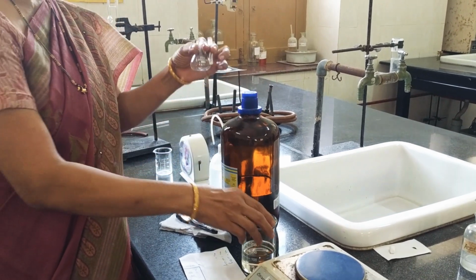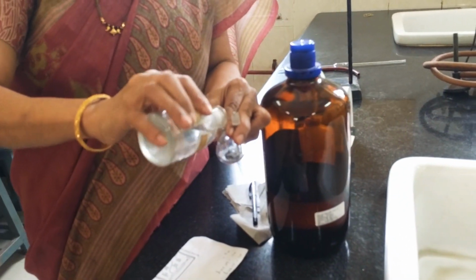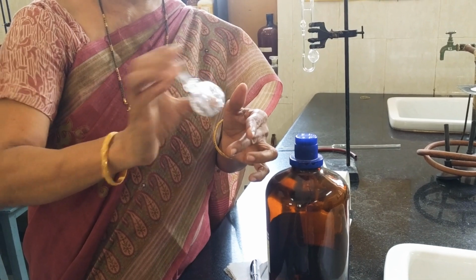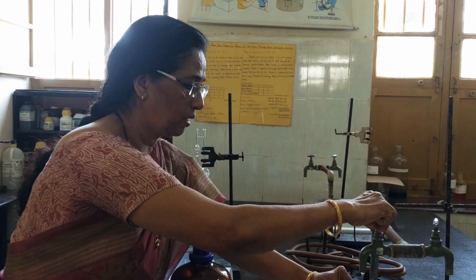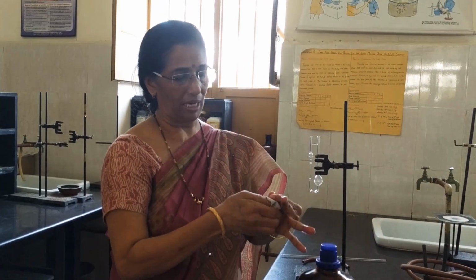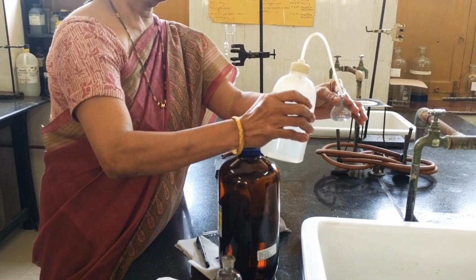Now since this is an organic liquid, I take a little bit of acetone. Ensure that all the liquid is well washed, because acetone can remove organic liquids very well. I'll pour back the acetone. Now wash my bottle well with water because now I am going to fill water. It's important that my density bottle is very dry when I take the first weight. If there is water or moisture, then it will give rise to a lot of error. That is the reason we take the mass of water in the end.